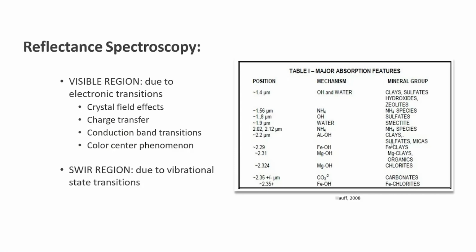Now, for mineral identification, that signature is going to be compared against characterized references for validated identification. So we'll see this done later on in the webinar, but you can actually do this by using a spectral library or mineral identification software.